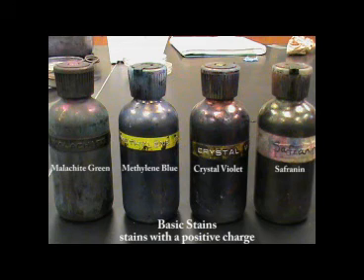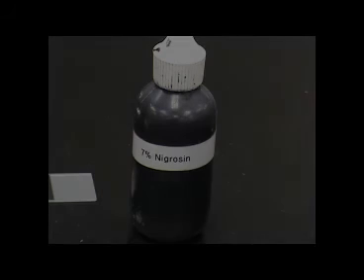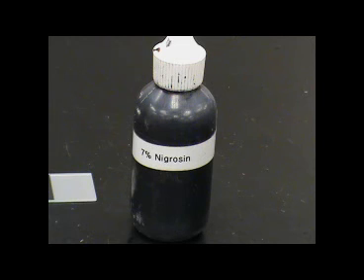The most common basic stains used are malachite green, methylene blue, crystal violet, and safranin. These are used to directly stain the bacterial cells for observation under the microscope. Another form of staining, known as negative staining, uses the property of acidic stains. Here, these stains have a negative charge, which is the same as the negative charge of the bacterial cells themselves. When using acidic stains, the background of the slide is stained, but the cells will remain clear or colorless.